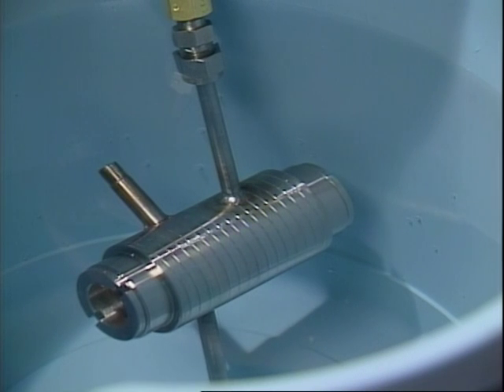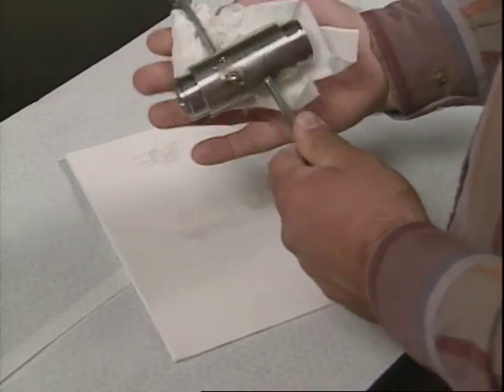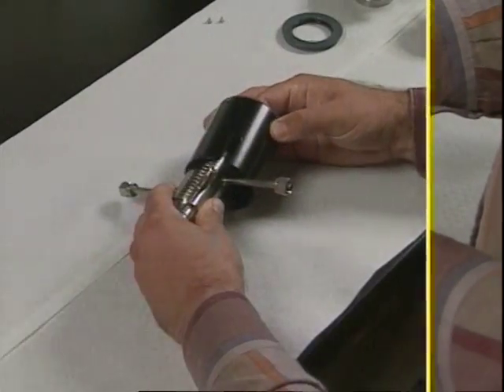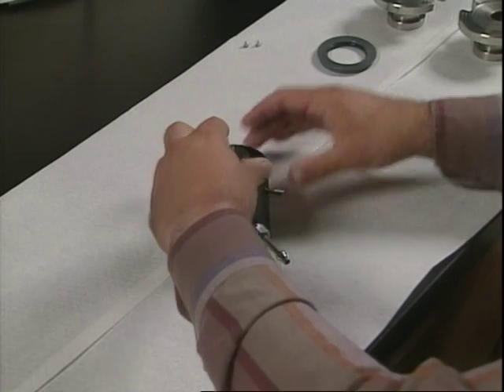If there are no leaks, the sample cell is ready for final reassembly. Dry the sample cell with a towel and remove the test equipment. If a leak check solution was used, be sure to clean the cell windows of any residual solution. After the outlet cover and flanges have been reinstalled, the sample cell assembly is ready to be reinstalled in the analyzer.